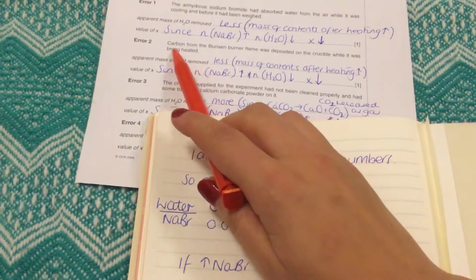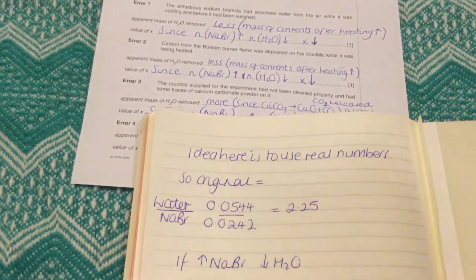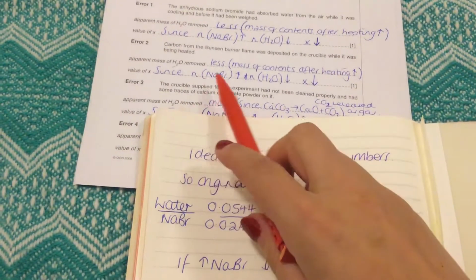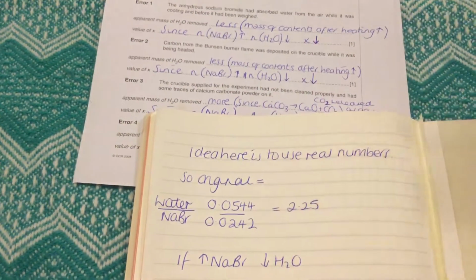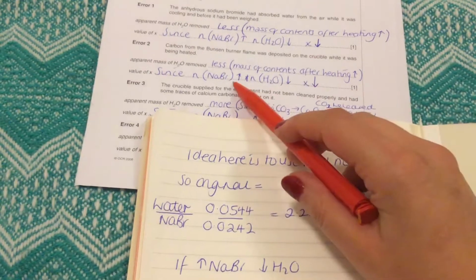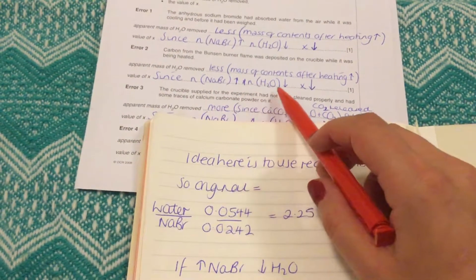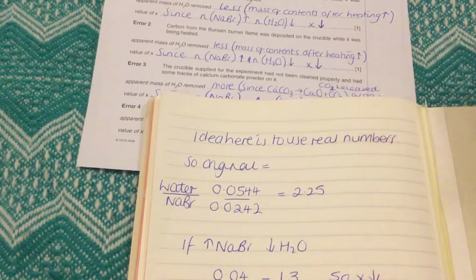Then if we have error 2, carbon from the Bunsen flame was deposited on the crucible when it was heated, so that would be due to incomplete combustion. The apparent mass of water removed again is going to be less because the mass of the contents after heating will appear to be greater. The carbon will add mass when we're reweighing that crucible. So again, we will have an appearance that the number of moles of NaBr will increase, an appearance that the number of moles of water will decrease, and using this same method, the value of X will go down.